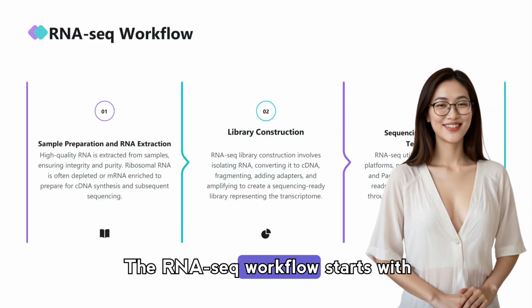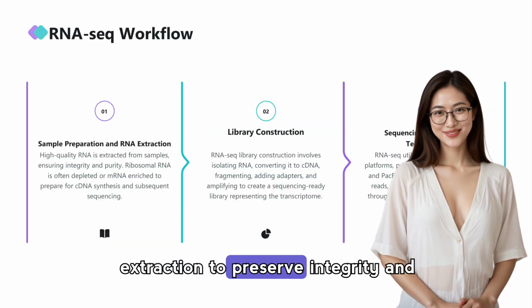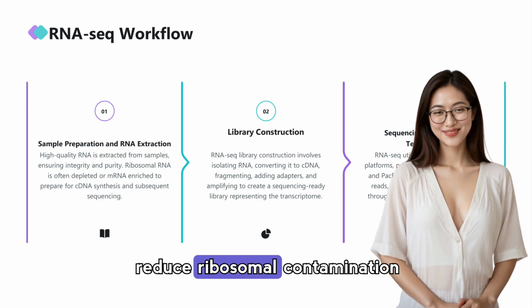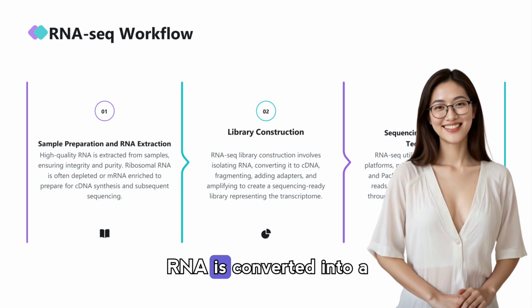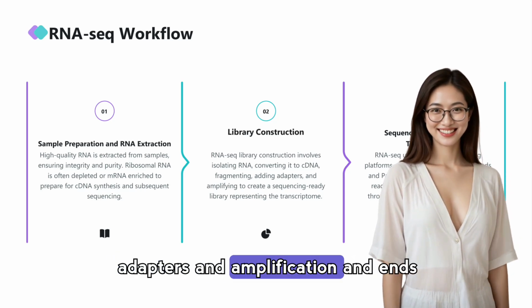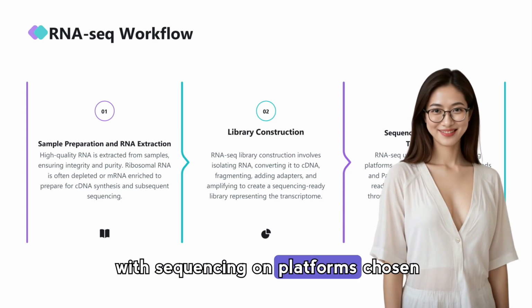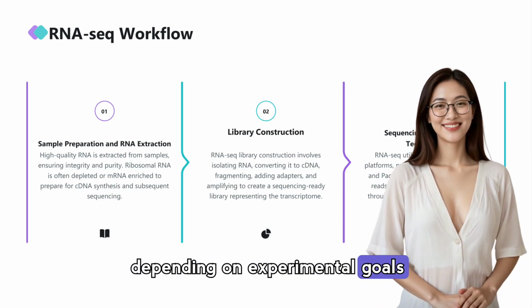The RNA-seq workflow starts with careful sample preparation and RNA extraction to preserve integrity and reduce ribosomal contamination, followed by library construction where RNA is converted into a sequencing-ready format with adapters and amplification, and ends with sequencing on platforms chosen for read length and throughput depending on experimental goals.